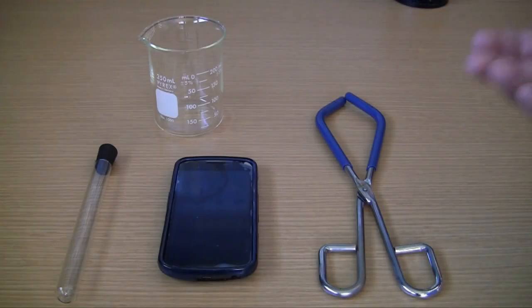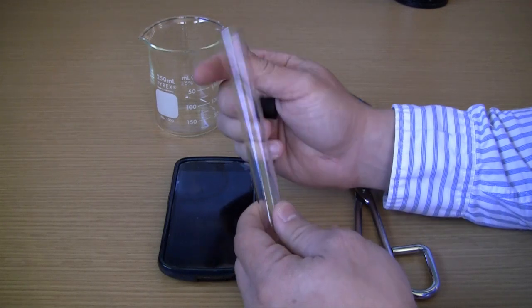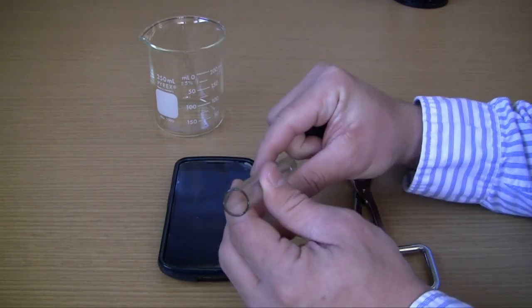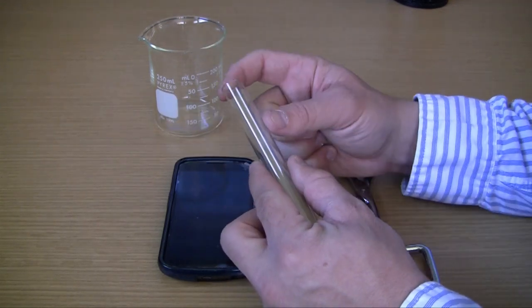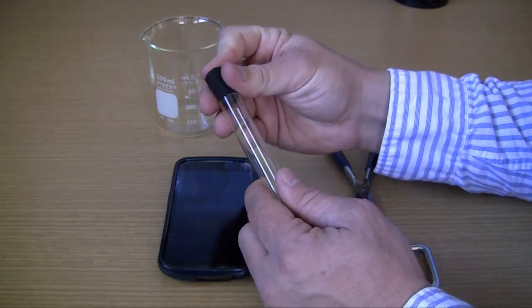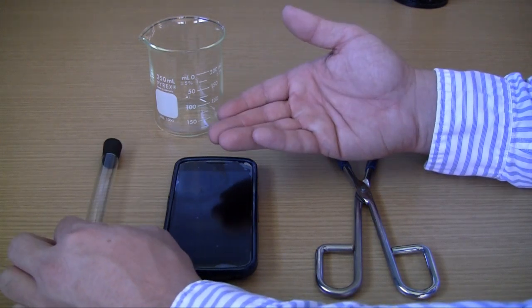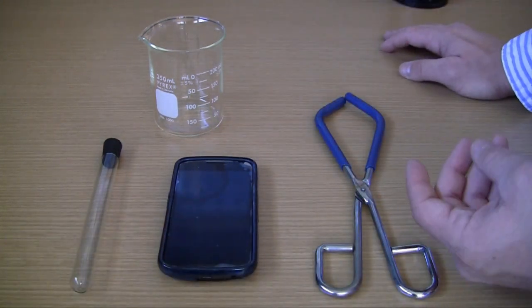Now let me go ahead and finish up and give you guys some really common sense tips. First of all, never use chipped or cracked glass. These test tubes right here, and test tubes in general, usually chip or crack a lot, usually right around the rim. So never use that because they can of course cut your fingers. And actually chips or cracks in glass is one of the main causes for injury in a chemistry lab.